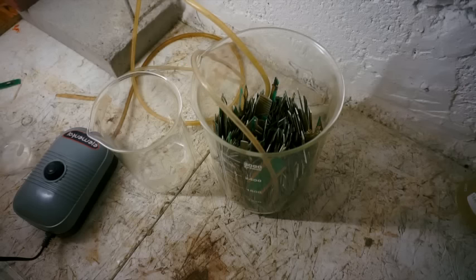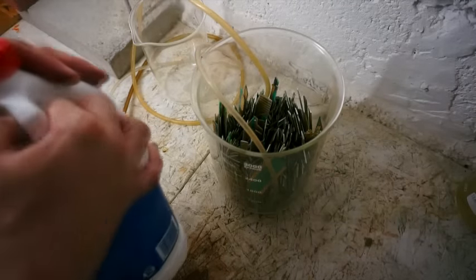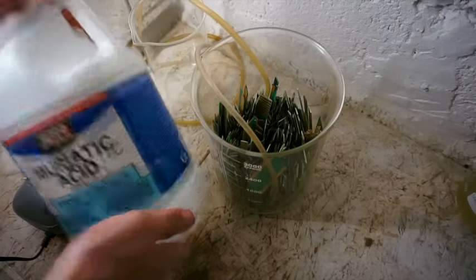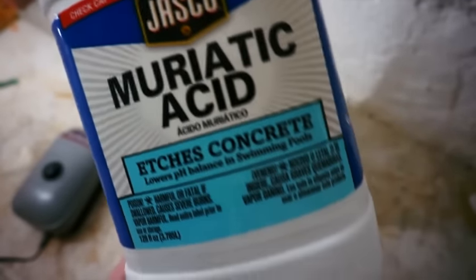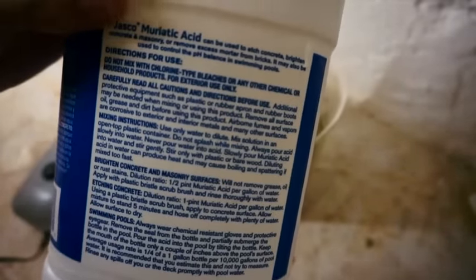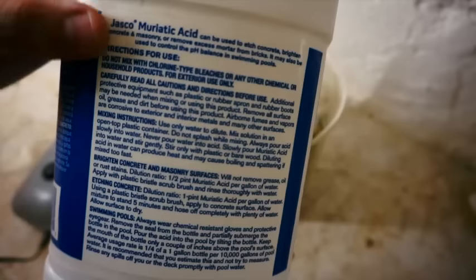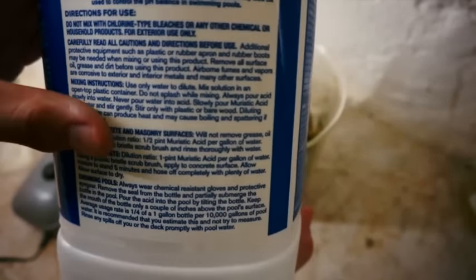We will start by adding 1,000 milliliters of hydrochloric acid. This is also known as muriatic acid and can be purchased from most home improvement stores. It is usually sold as concrete etching acid or as a solution to lower the pH in your pool.